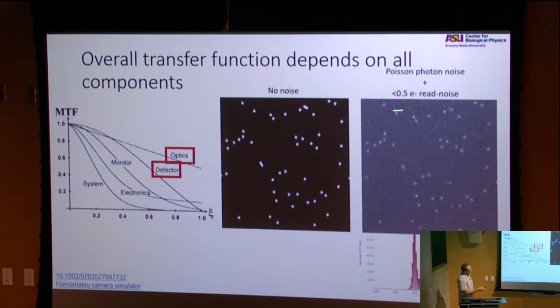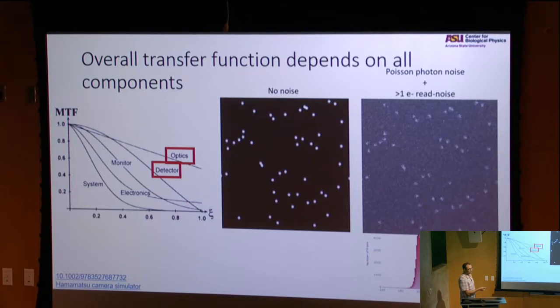This camera does exist now. Hamamatsu just released it. It's called the qCMOS. There now exist fluorescent imaging cameras that have under an electron of read noise, and you can actually resolve the photons on the detector. But most cameras look like this. We actually have no idea, very concretely, about all those individual peaks we saw in the last one that correspond to zero photons, one photon, two. Here's the noise floor, right? Now everything's blurred together, right? And so typically we need some sort of statistical model to estimate the number of photons that are underneath there as well.